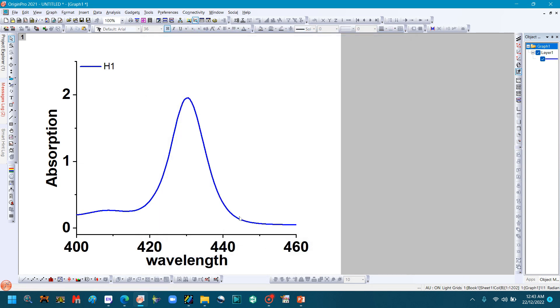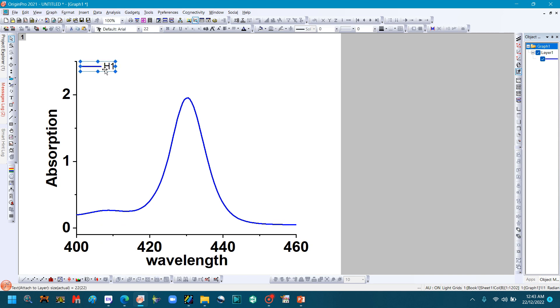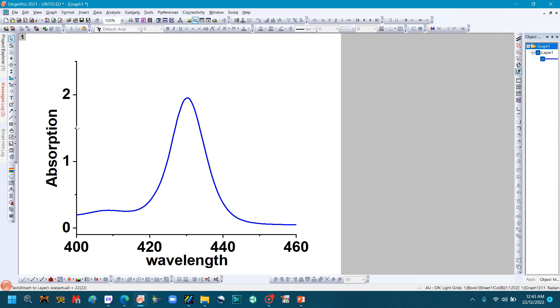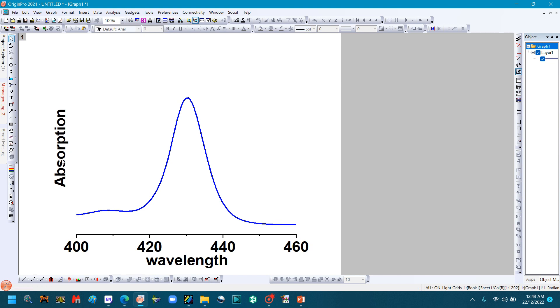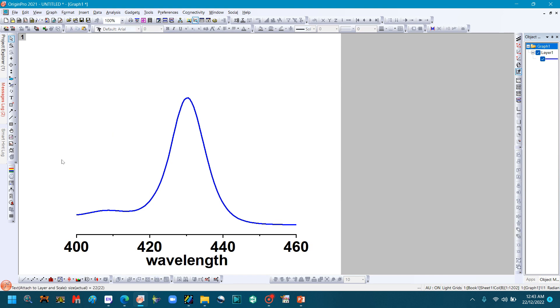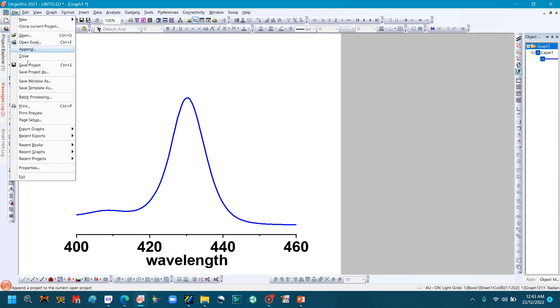I think this looks good. You can also minimize the delay from this side and this side too. After making the zoom file, you will remove the box here. You will remove the y-axis—click the y-axis and delete it. Select and delete it, simple.